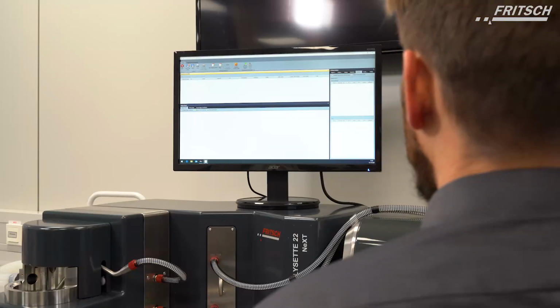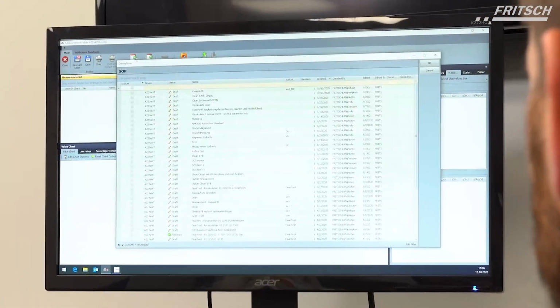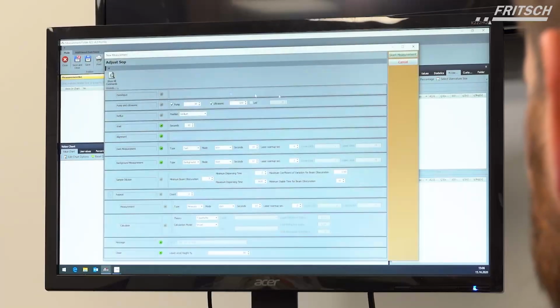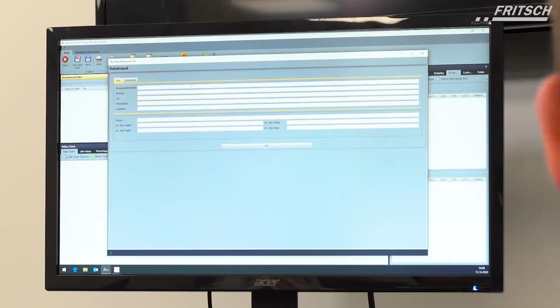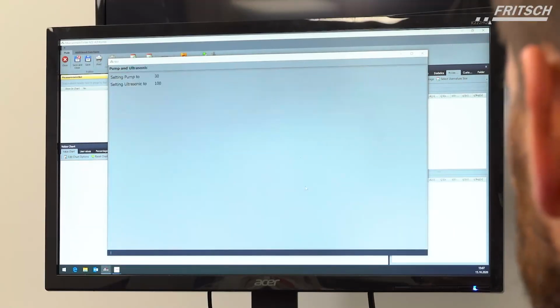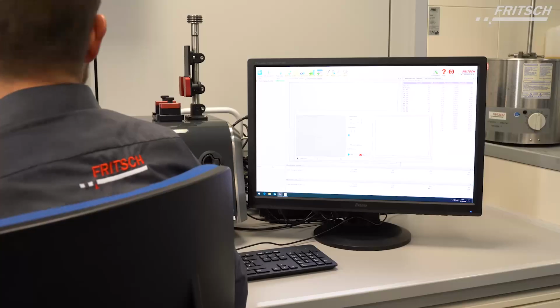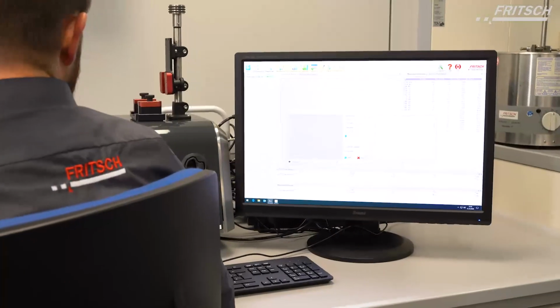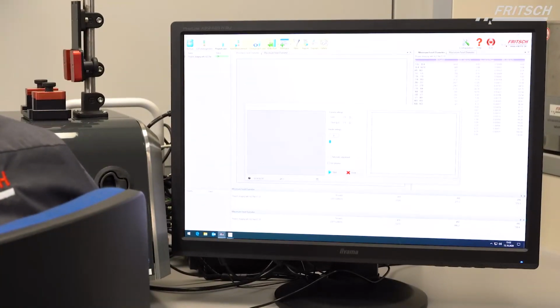As I mentioned before, we control the entire process through the A22 software Mass Control. Here we select our SOP, click the Start button, enter some last information and hit OK. Now the pump is starting and we can already have a look at the A28 software and see the live picture of our liquid flowing through the cell.